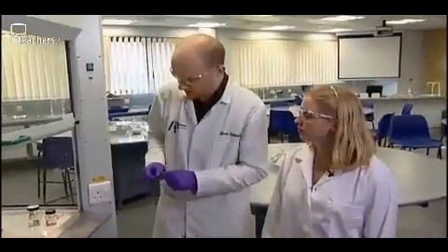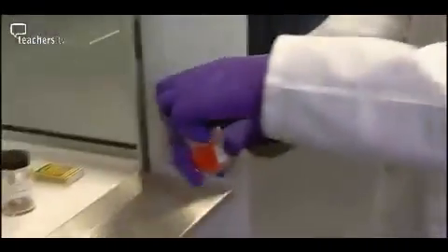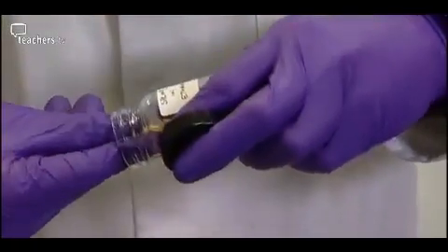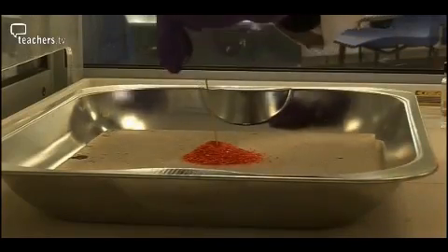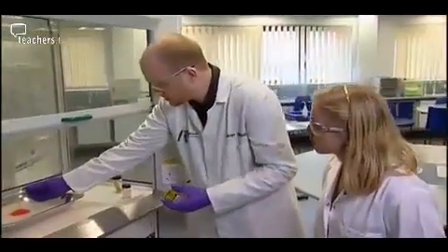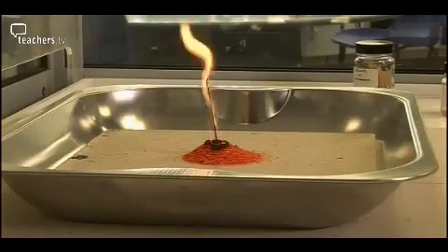So what we're doing now is a really nice demonstration with some ammonium dichromate. What we're going to do is take our ammonium dichromate and use a methanol-soaked splint to help start the reaction off. We'll put this in the middle. You actually get a really dramatic reaction where you can see the changes. The reaction is best carried out in a dish to contain the flakes.